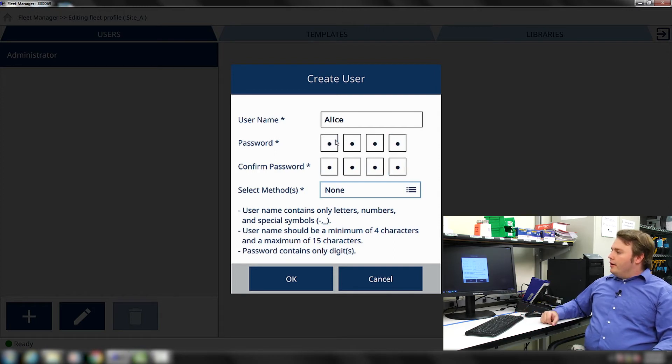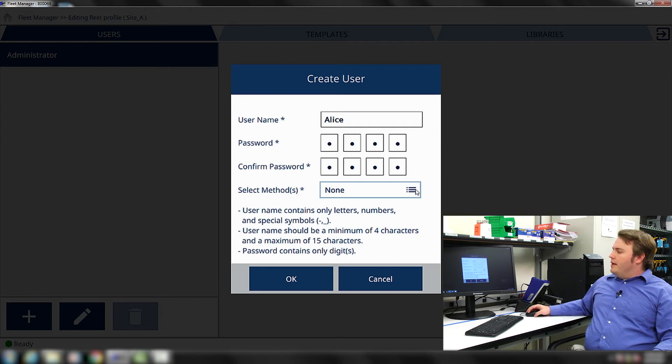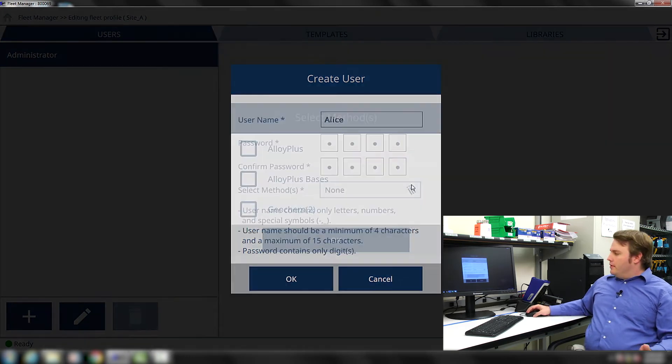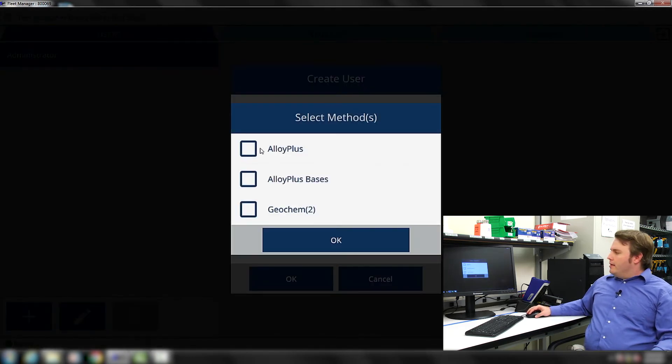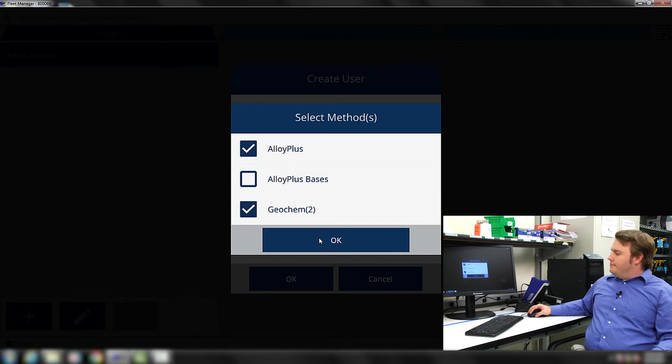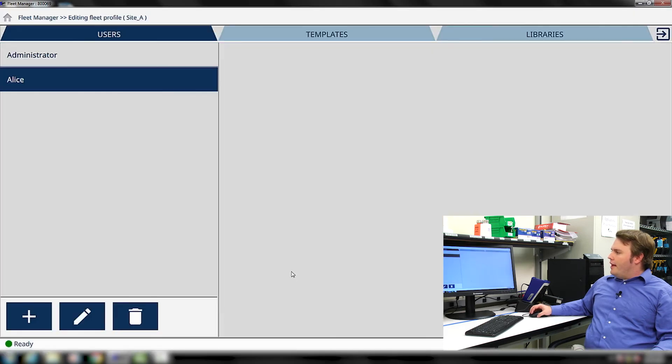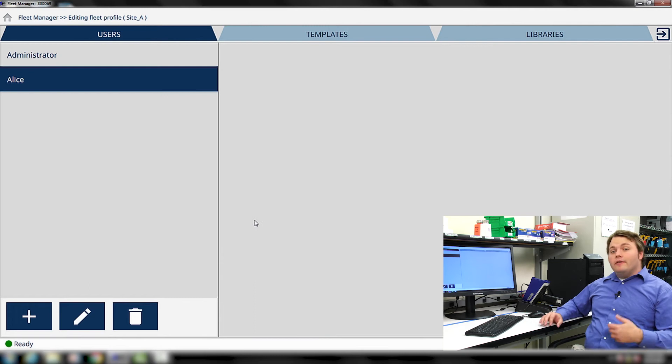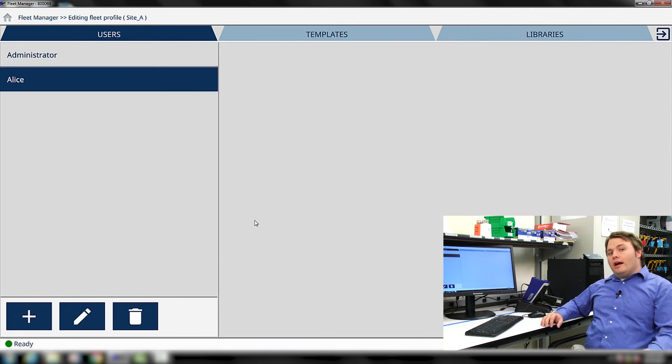We also have to select which methods are going to be available to Alice. I'm going to make her have access to Alloy Plus and Geochem. With that, you press OK, and we've now created a new user for Alice.